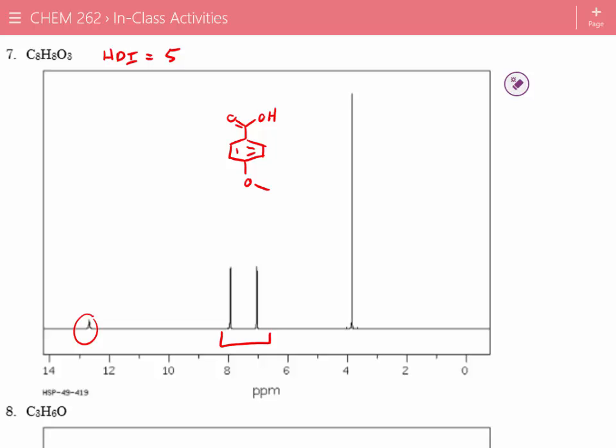And in particular, let's try to label all of our protons. So I'm going to go through and label them as blue. So I'll label this HA. If we look down here, these are both HBs. These will be both HCs. And then I'll label these HDs. And let's see if we can assign these. So let's start with HA. We said that that's probably a carboxylic acid proton, so I'll label these HA.